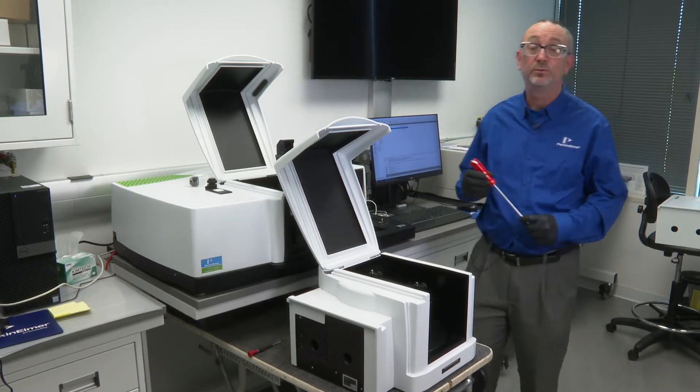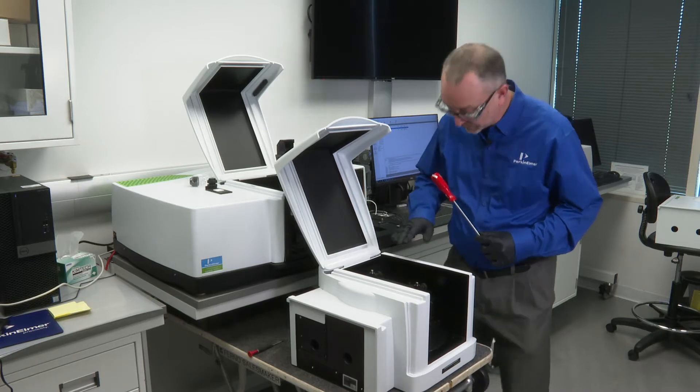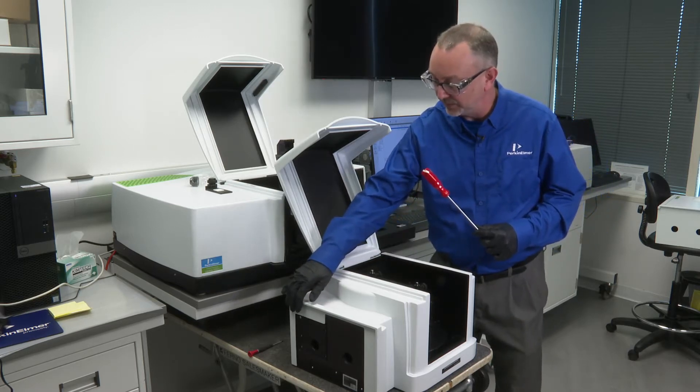We're going to go ahead and show you how to swap out the TAMS detectors. There are two: the sample detector here, currently in the home position, and then the reference detector over here.